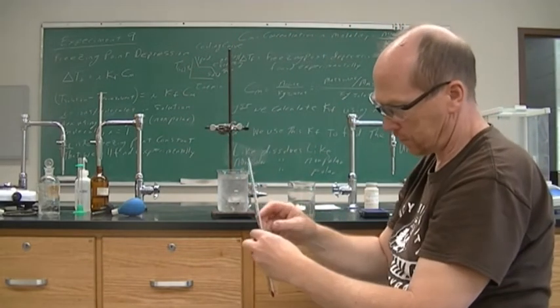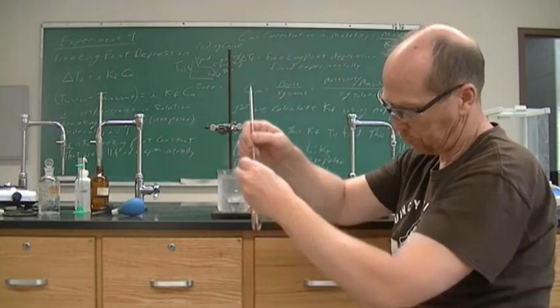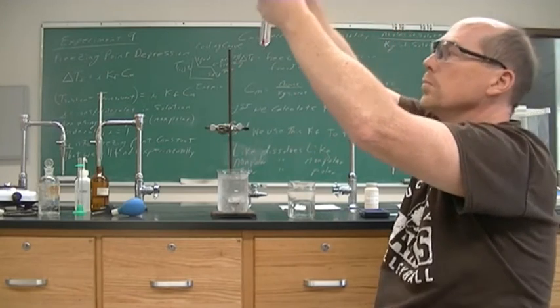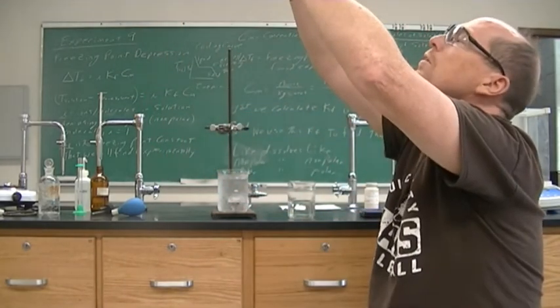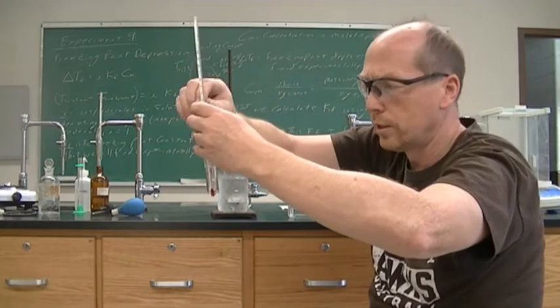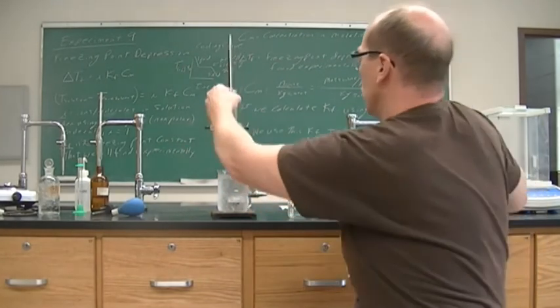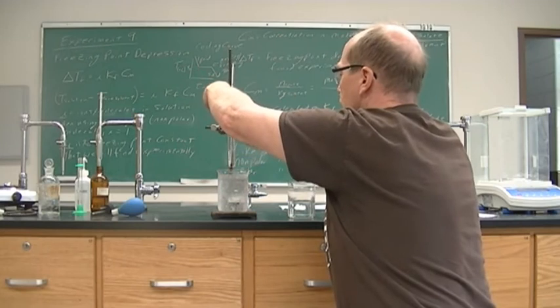All right. So it is completely dissolved. So there's no solid left in there. It is completely dissolved in the 10 milliliters of the cyclohexane. So now we're ready to freeze this.